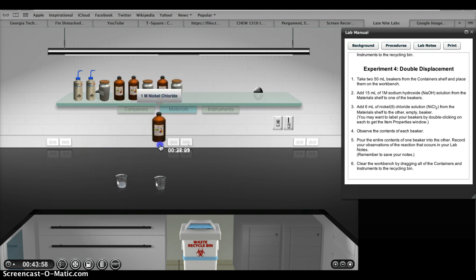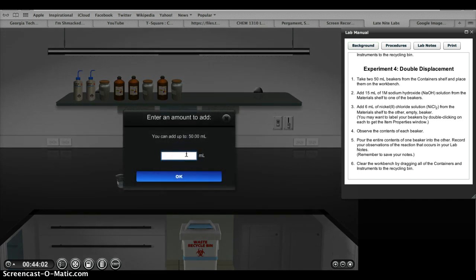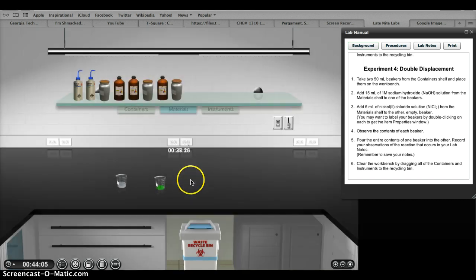And we'll add 6 milliliters of nickel chloride. And it's also clear, and it's green.